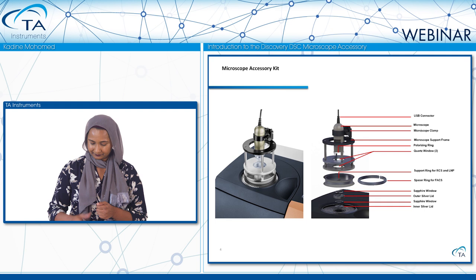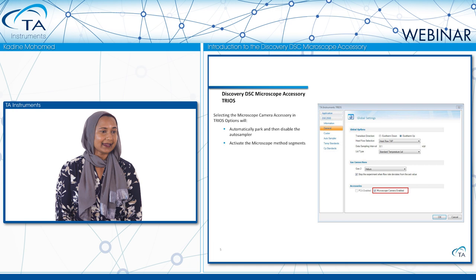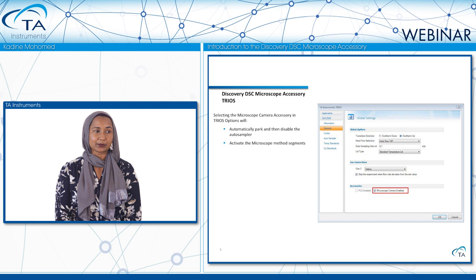Setting up the accessory in the software is quite easy. You go to the TRIOS options selections, and in there you'll find a checkbox for the microscope camera accessory. By checking this box, it will automatically park and disable the autosampler if one is installed on your DSC, and it will also activate the microscope method segments.